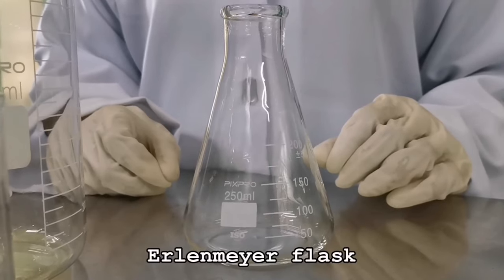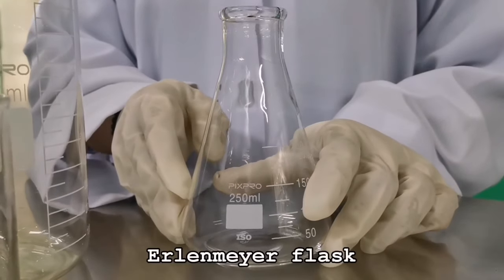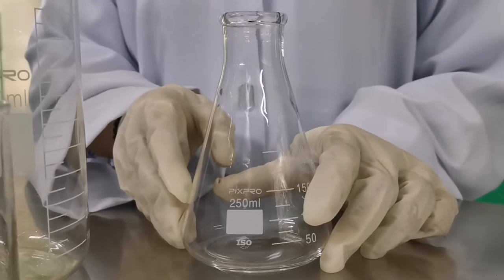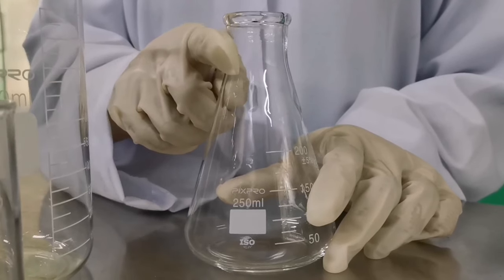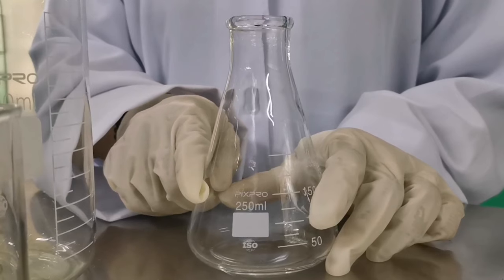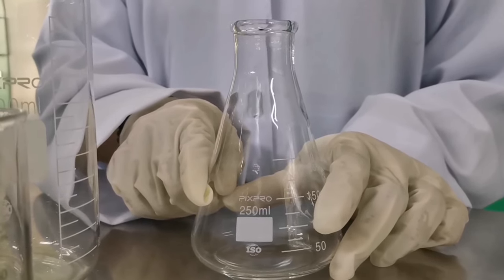Erlenmeyer flask. We often do chemical reactions in flask. Its narrow head prevents chemicals from splashing. Beakers and flask only hold stuff, but we don't generally use them for measurements, even if they have lines and numbers. They don't have very good accuracy.